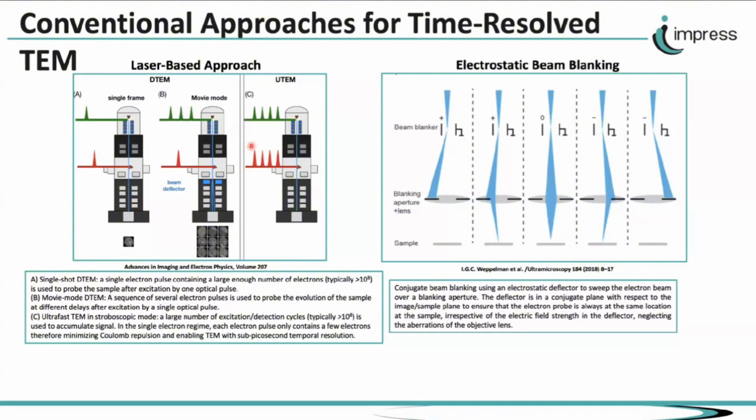There should be a delay line because of the geometrical difference between these two sources, and then you study the sample, which provides, of course, much less signal, but it would be a stroboscopic measurement, so it works for reversible phenomena, for example, a spin transition or plasmon transition, something like this. Then you will collect enough signal to be able to create an image or a spectrum.